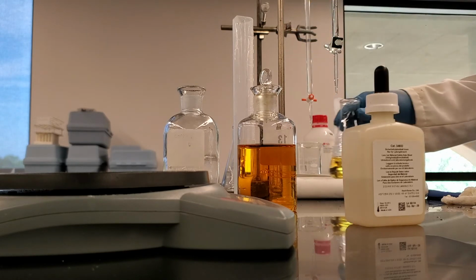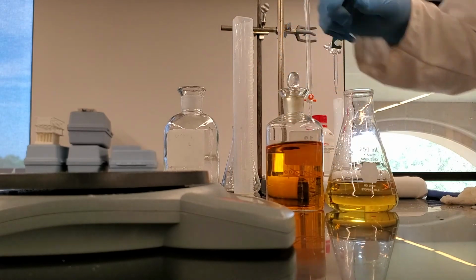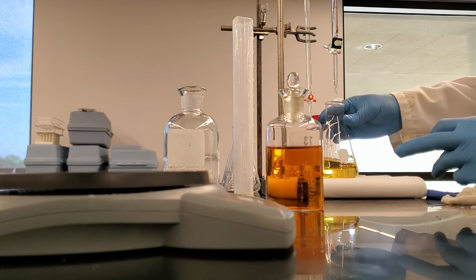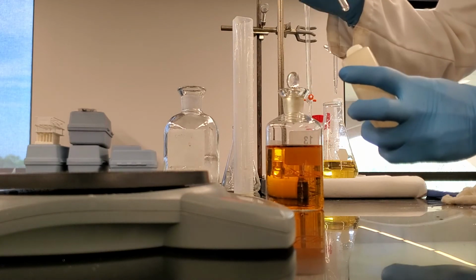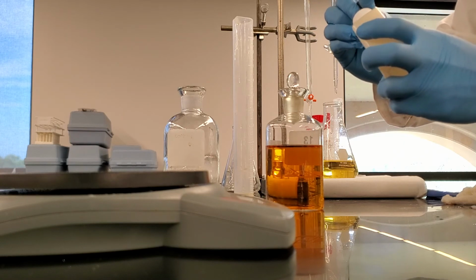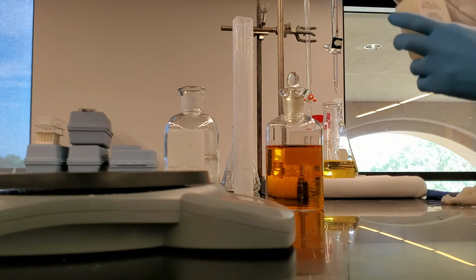If you see these two, there is a clear difference in the yellow color. I would call this a pale yellow color. At this point, I'm going to add 2 1 ml drops of starch indicator. So this is filler. It has 0.5 and 1 ml mark. Press the top, put it inside, and gently release the top. It will collect the liquid. It's almost right there at 1 ml.